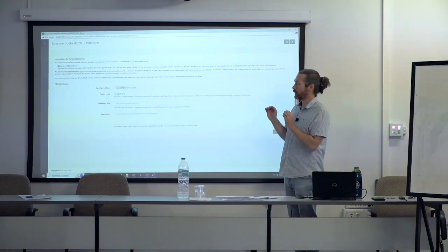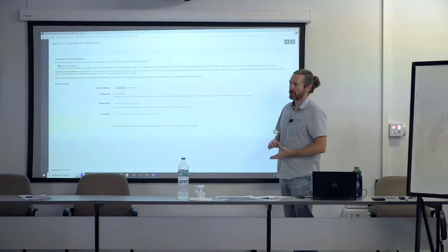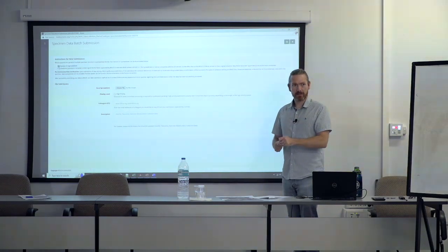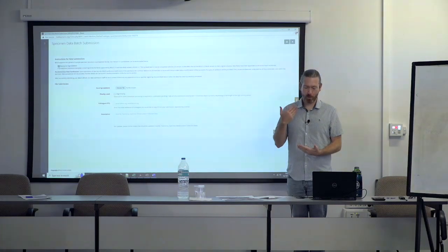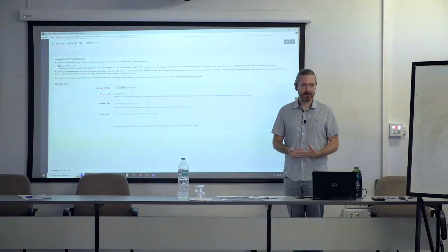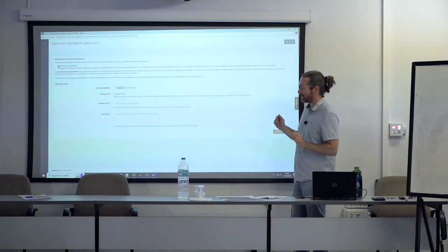That is great. We need a semi-automated curation for the sequence data that goes in and says this sequence is matching a different species name. Are you 100% sure you want to upload this to BOLD? You know, that sort of thing. Not there yet, but hopefully we will get there. And the team at Guelph is great.